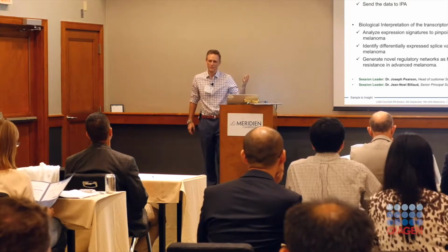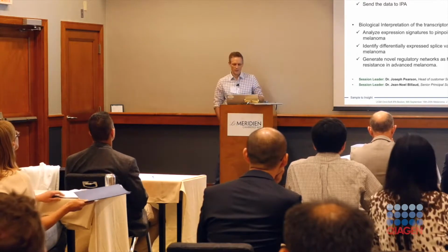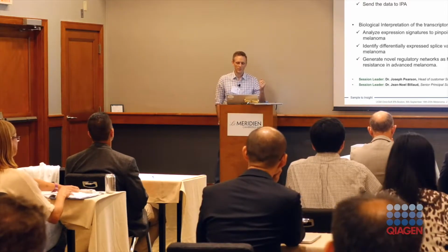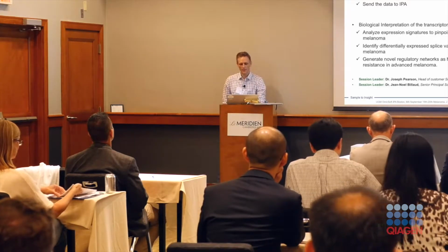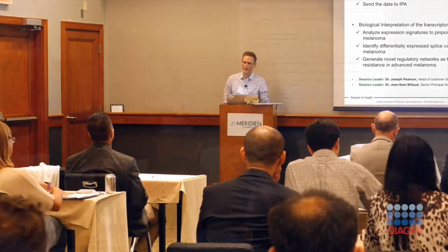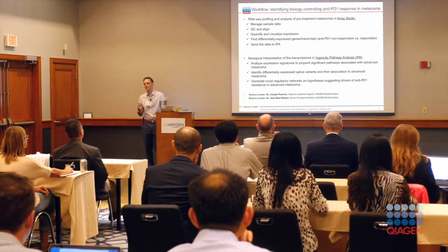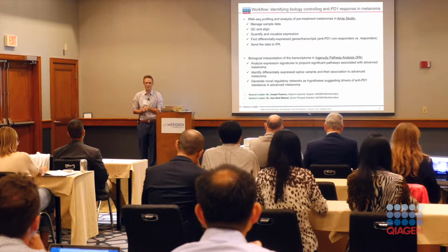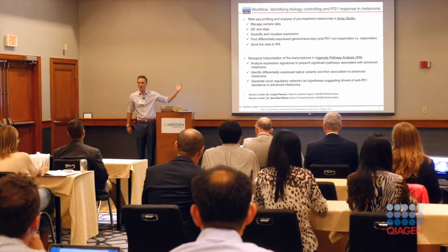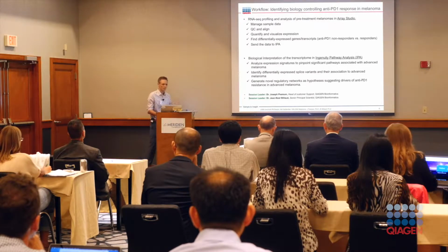As far as the actual steps that we're going to walk through today, I will be taking you through the basic RNA-Seq pipeline. As many people are aware, the RNA-Seq pipeline can start from managing just the raw sample metadata, raw and aligned QC and alignment, quantification and visualization of expression, and then identifying differentially expressed genes and transcripts. Because many people are aware of this pipeline and have watched the videos or read the tutorials, I'm not going to just walk through all of the steps, but instead focus on a couple of the key features and maybe unknown or new features that you may not be aware of, some cool tips and tricks.